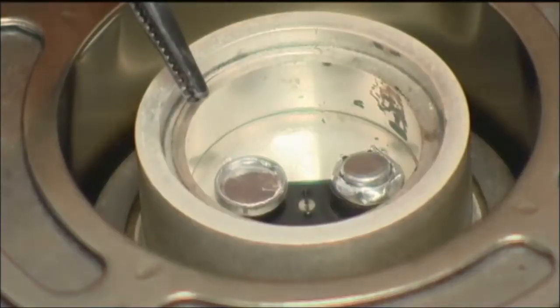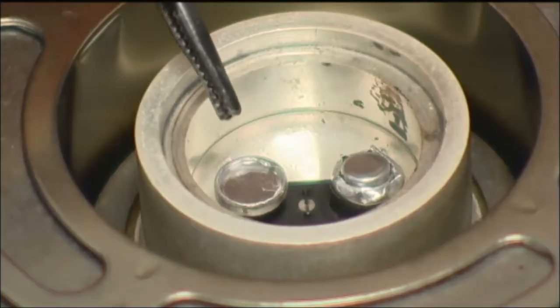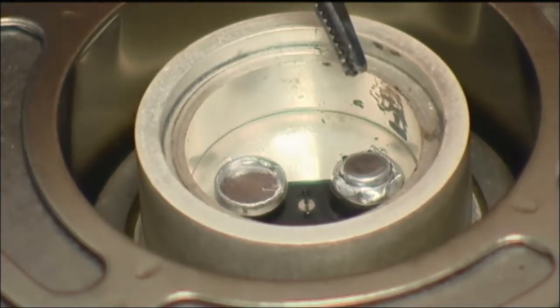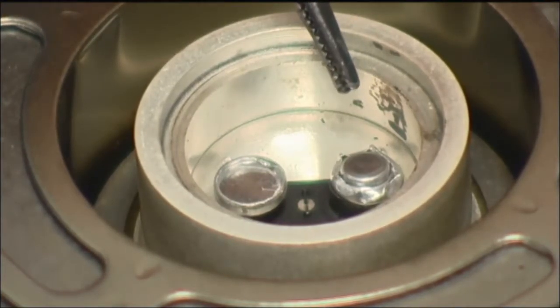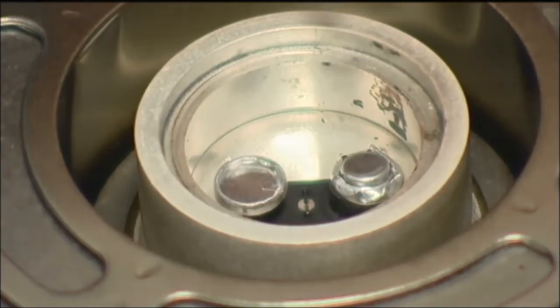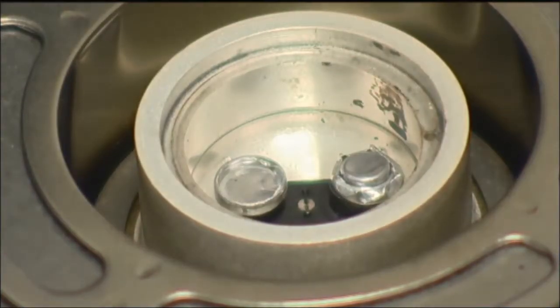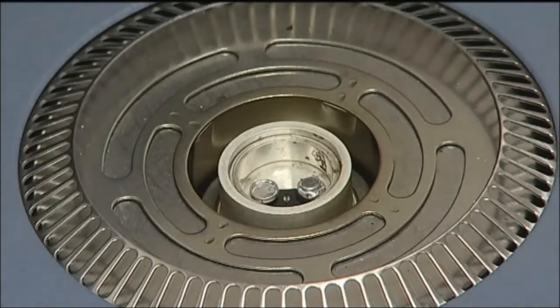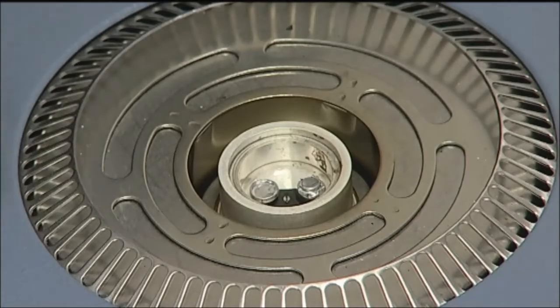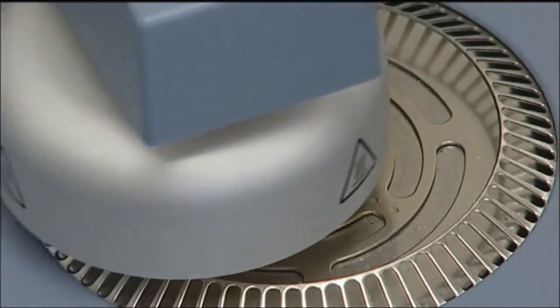On the left side we have an empty pan as a reference. And on the right side we have the aluminum pan with the sample for the DSC analysis. And close it. Then we are ready to start the DSC analysis of the sample.